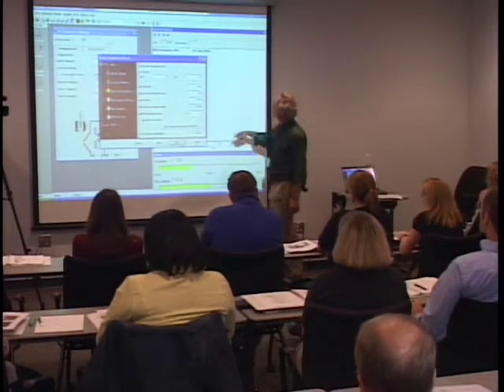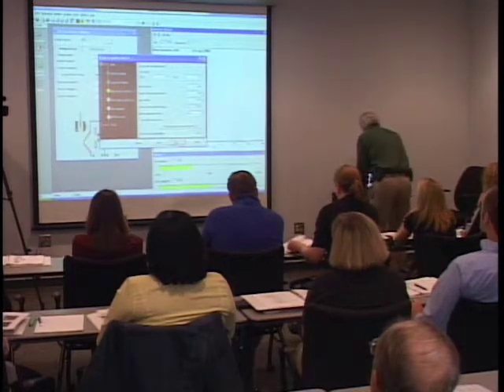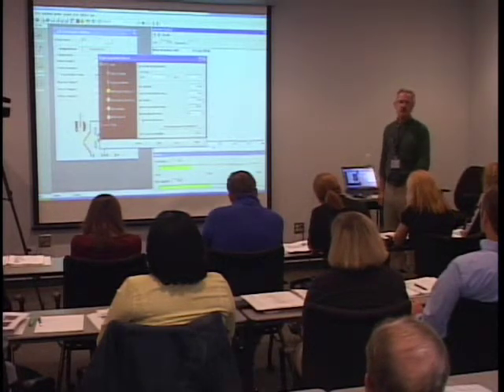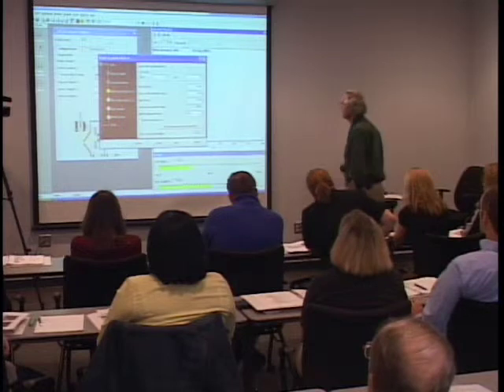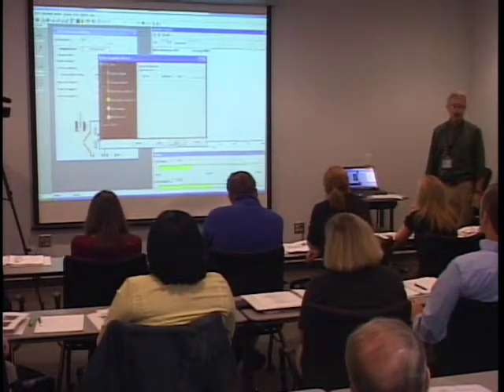On this page really only a couple of important things: start and ending mass. We want to lower the starting mass — this was set up to go from mass 60, so let's set mass 10 in there. Let's make this a small data file and acquire up to mass 150 or 200. The stop time means it'll stop acquiring at 10 minutes unless you press stop first. The recording interval means it'll store one spectrum per second — for DART that's pretty good. I like to acquire profile spectra, which means you see the whole peak shape, rather than centroid data.